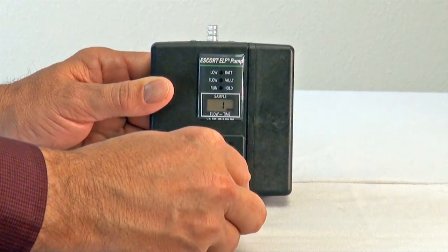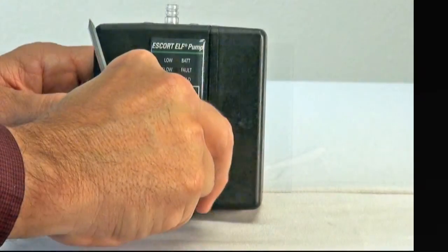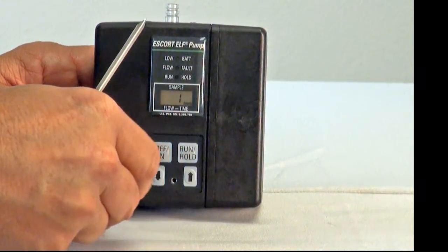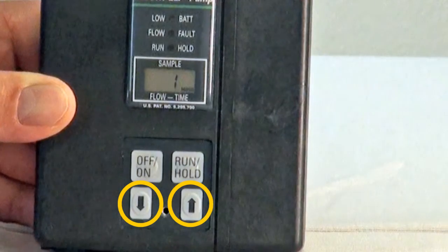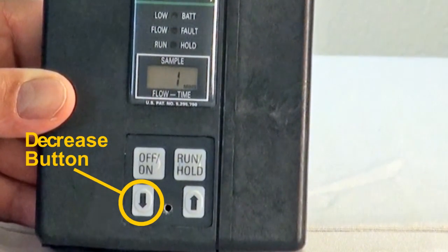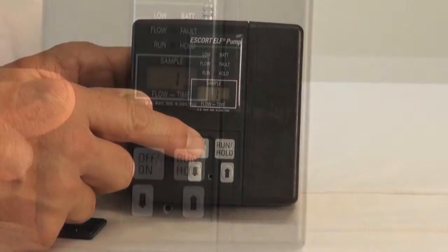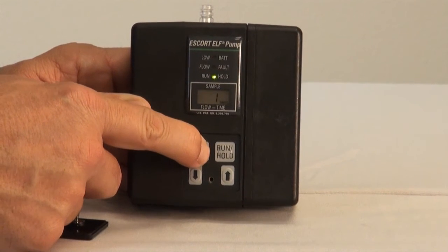To turn the pump on, you must first remove the switch cover using the slotted end of the Zeffon screwdriver. The control pad consists of four buttons: the on-off button, the run-hold button, and the flow rate buttons — the down arrow for decreasing the flow rate and the up arrow for increasing the flow rate. Press and release the on-off button to turn the pump on.